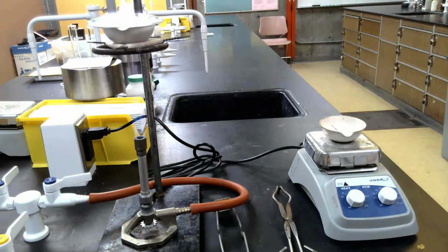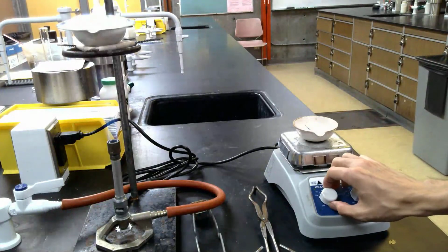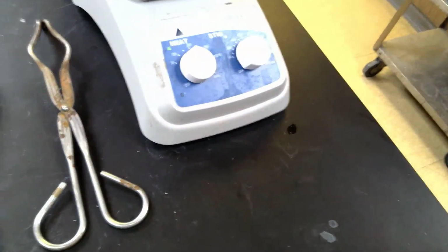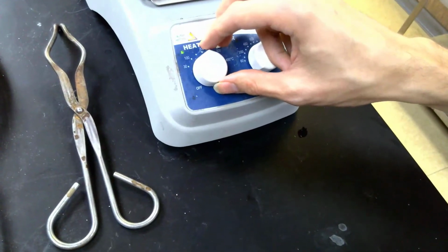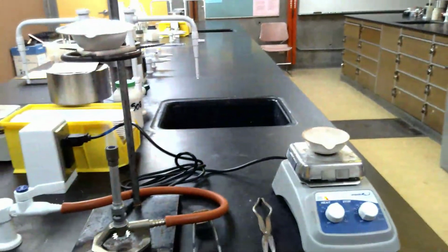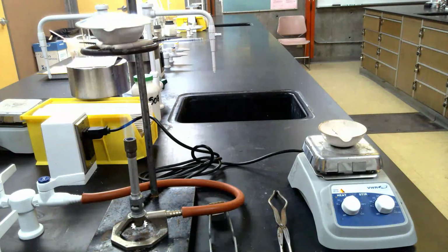And as far as the hot plate is concerned, there's just a heat dial that I can adjust to begin heating the mixture. And if you look closer, you'll see that there's numbers all around the dial. So all you do to get a higher heat value is just to turn the dial more clockwise, and that'll raise the heat.